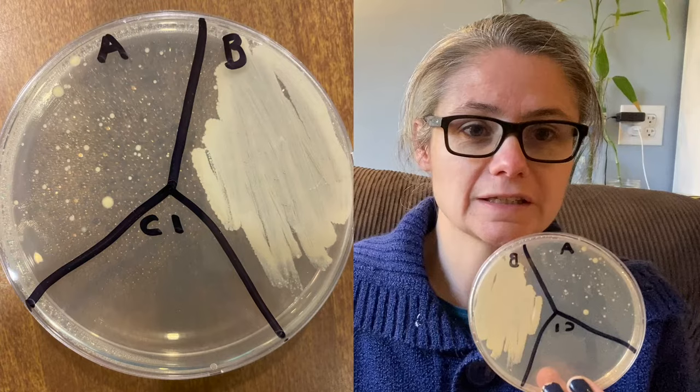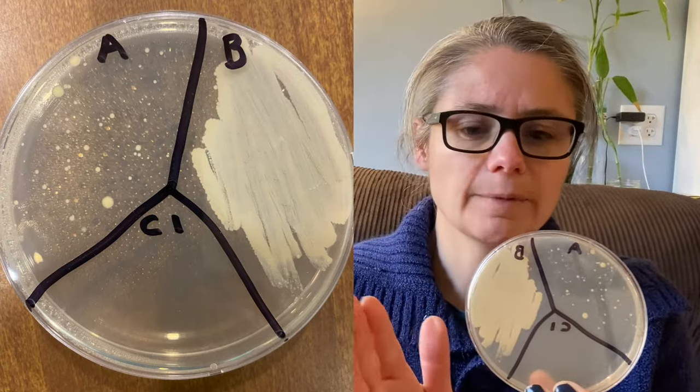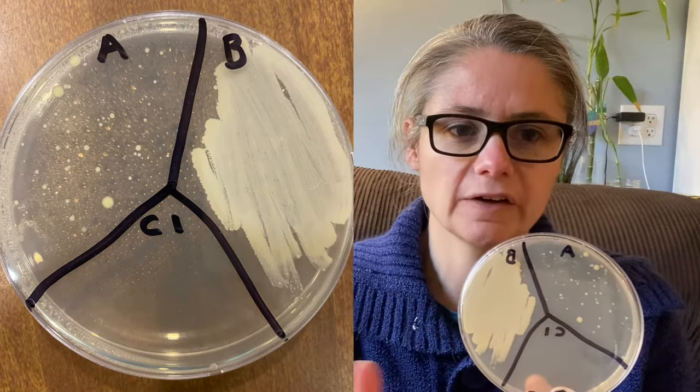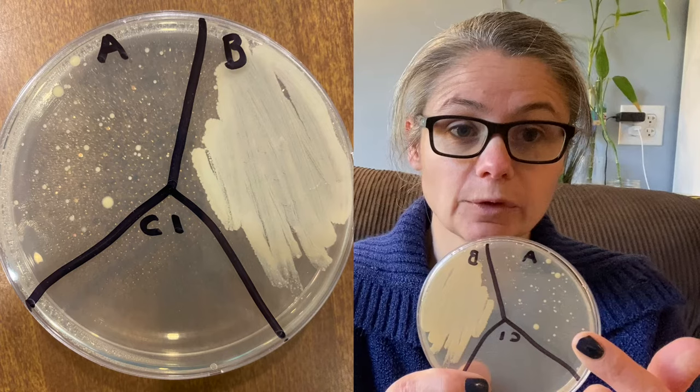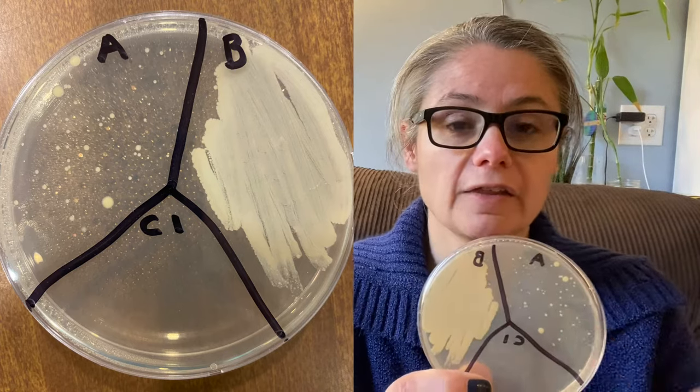Now for some results from Clorox bleach in the toilet bowl. All right, so as you can see here, the before cleaning, there's a lot of bacteria there. Way too many to count. You can't count those colonies, just smears of bacteria. And in the after cleaning with Clorox bleach, I counted about 50 colonies in the after area.